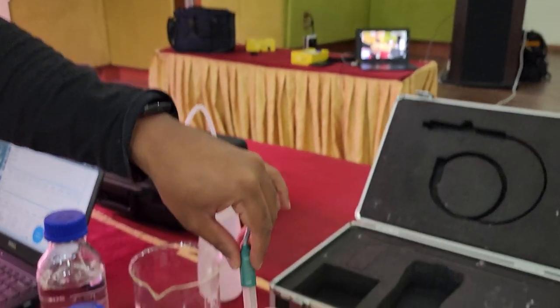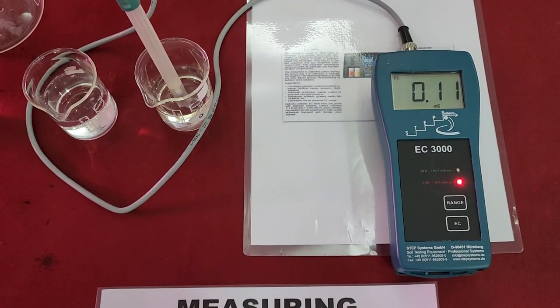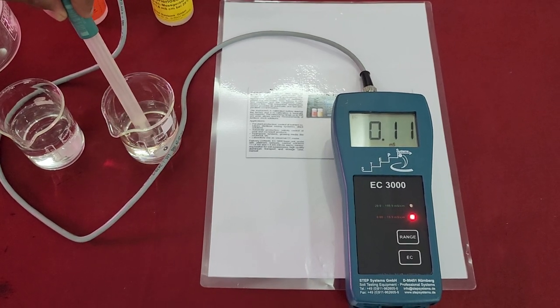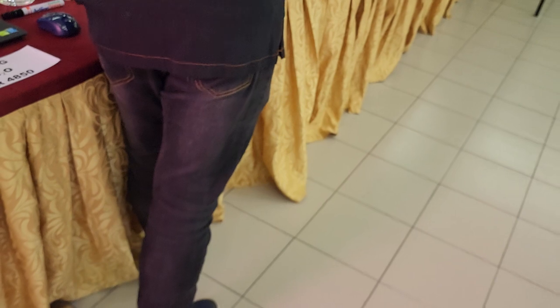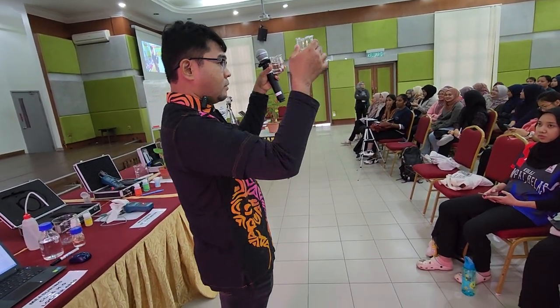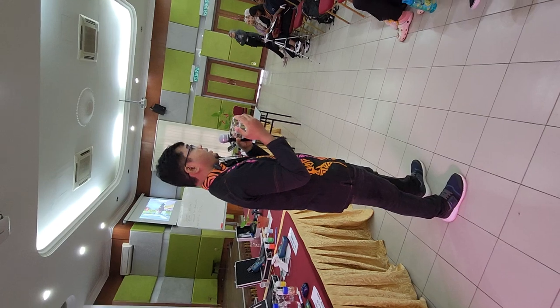Let's test the pond water. Okay, what's the EC? 0.11. That's interesting. So from 0.02 to 0.11, how many percent more? Distilled water, pond water. So don't be deceived by the transparency of water. There's a lot going on in here. However, one thing about EC, it doesn't tell you what is in the water.